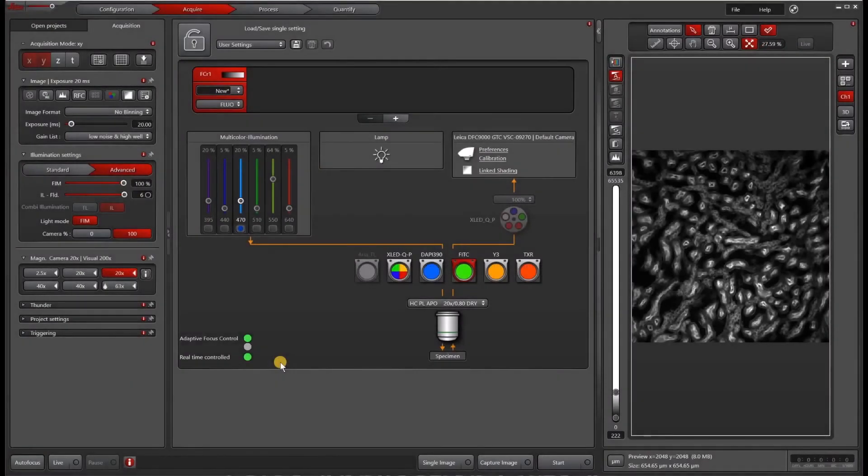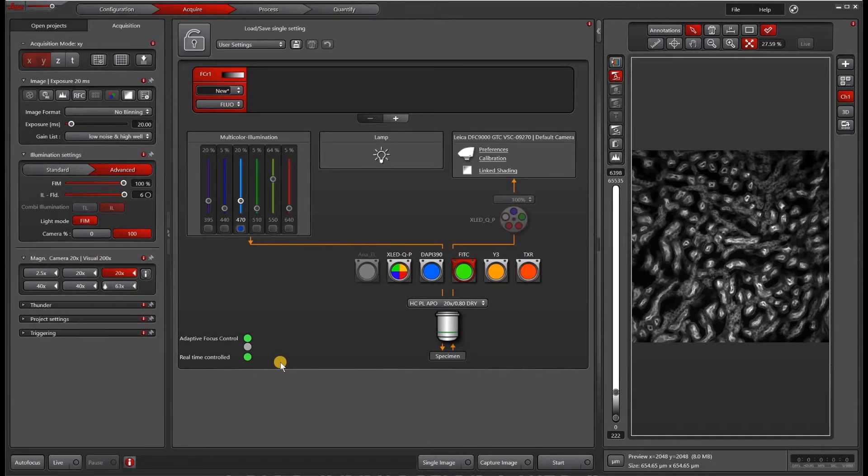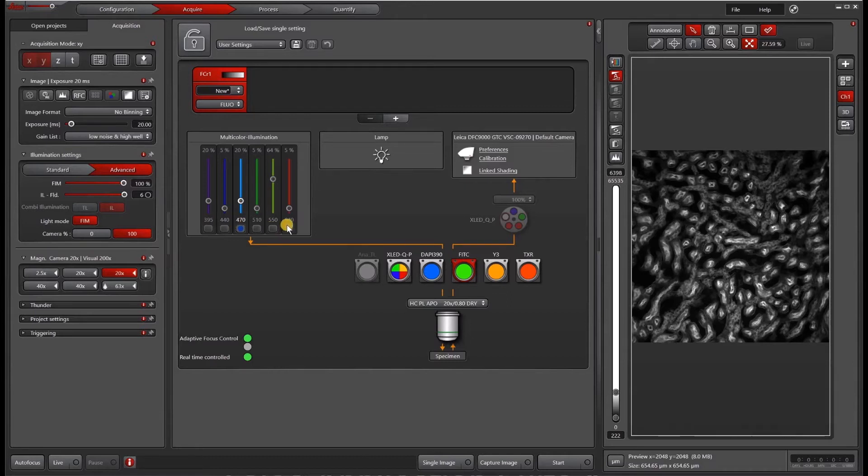In previous videos, we've shown you how to create a channel setting in LAS-X using a traditional illumination excitation emission system. But what if you have a slightly more complicated system such as this one, which includes a six-line multicolor LED plus a quad cube and an emission filter wheel.